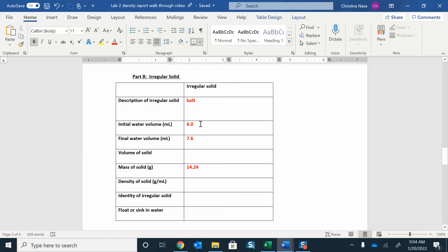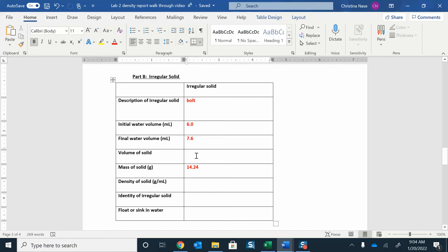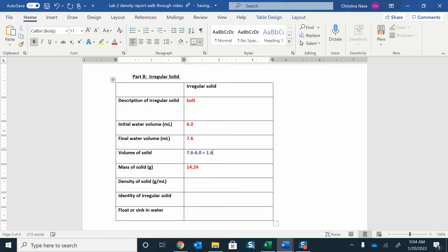I read my initial water volume was 6, and then when I put it in water, it displaced the water and the new volume was 7.6. So I can say that the volume of the solid is the difference in how much water it displaced. I'm just going to do my 7.6 minus 6.0 and take the difference between those volumes. I got 1.6 milliliters.